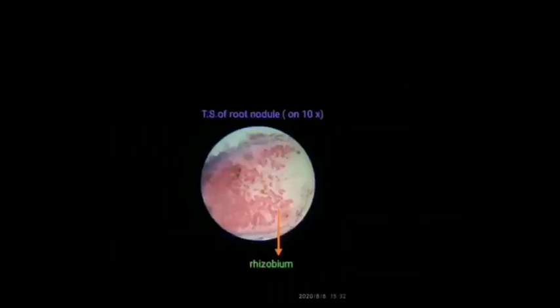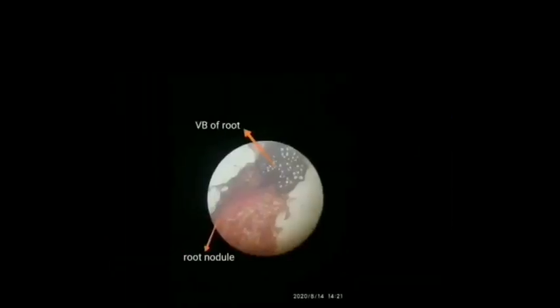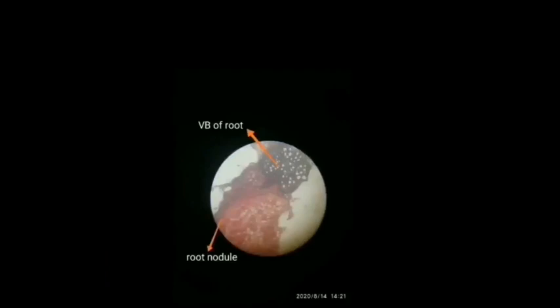This is the section of TS of root nodule on 10X, where we can see rhizobium. This is the section of TS of root where we can see the vascular bundle of root as well as the root nodule.